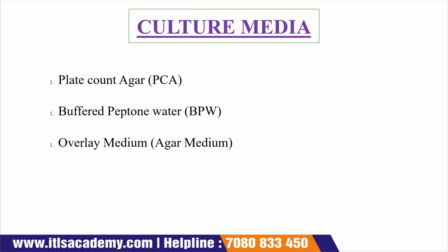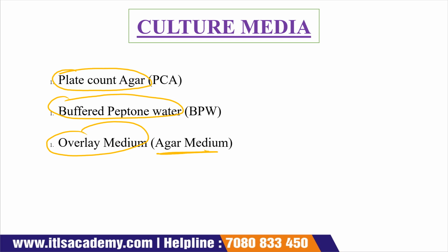Now the next is your culture media. Here we require plate count agar media, buffer peptone water, and overlay media, that is your agar media. Now what is the composition of the plate count agar? We have to know it.